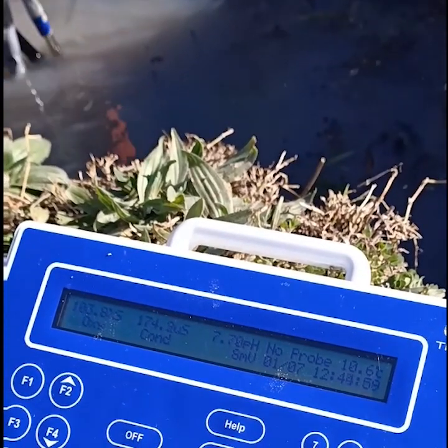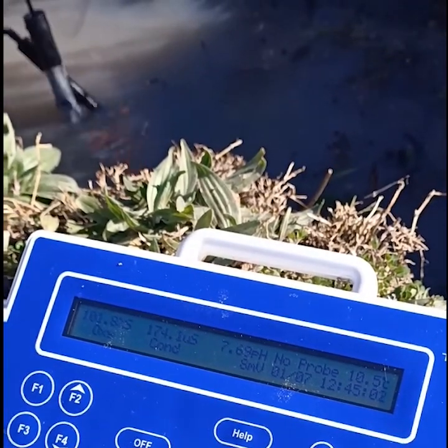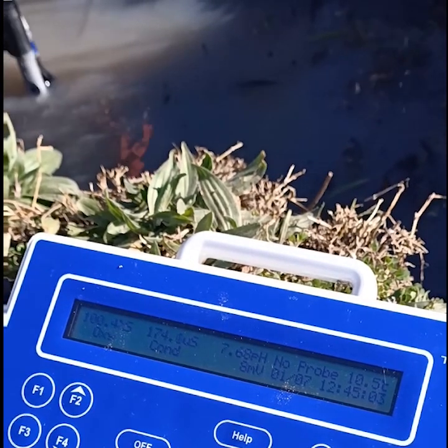Sometimes you are able to leave the meter on the bank and dangle the probes in. If you can't get into the wetland, then you can get a bucket of water, say no more than 5 litres, and measure the water quality in the bucket. Just make sure it is in the water that is clean and hasn't been disturbed.